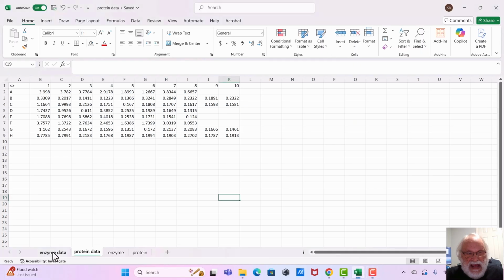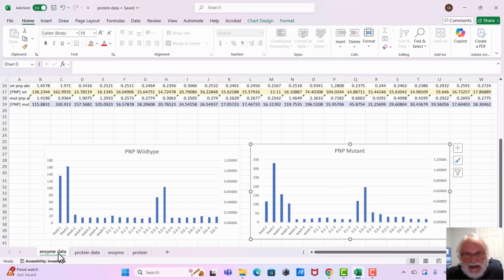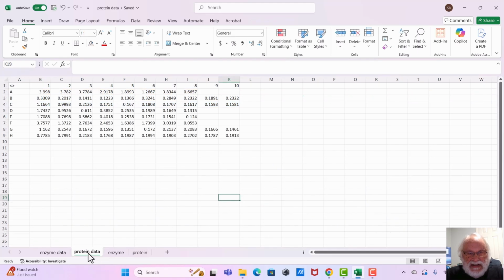Hey, welcome back. I want to talk to you a little bit about what we did in the last part, in part one of this video. We were actually in this other tab. I copied everything into one spreadsheet just to make it a little bit easier. We generated these two graphs. And what we're going to do for the protein data is essentially generate the same two graphs, but we're going to have one little twist in there.